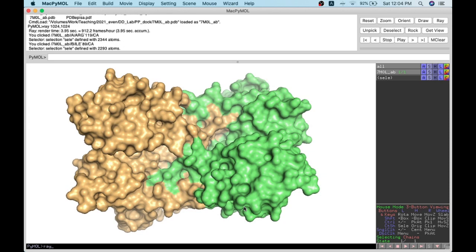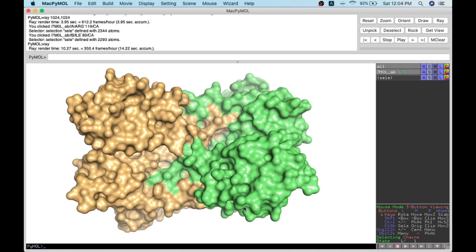I make an image with dimensions 1024 by 1024. It takes some time because now it has a bigger molecule in surface representation. Once rendered, you can see the structure is smoothened — when you are making changes it appears rough, but after rendering the structure is clean. You can then save the image in PNG format.